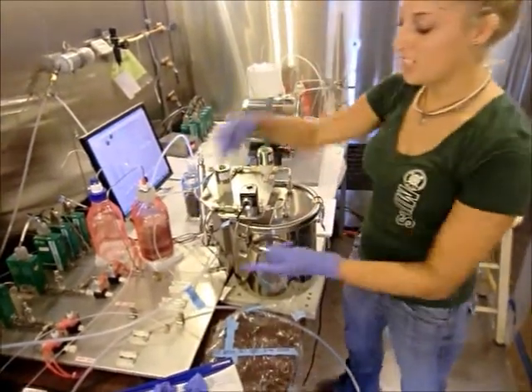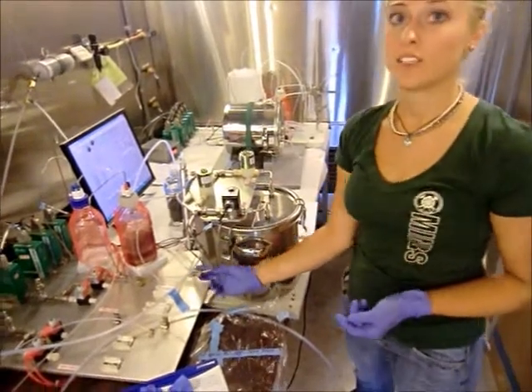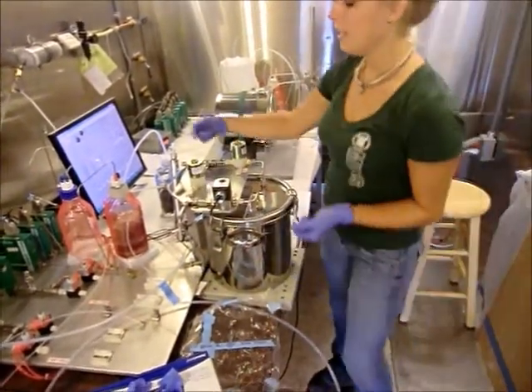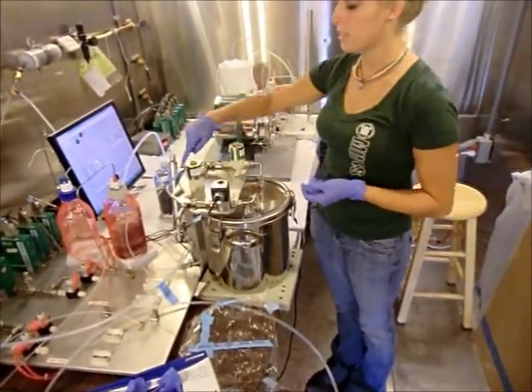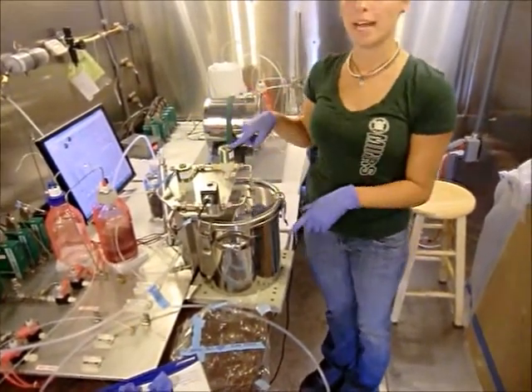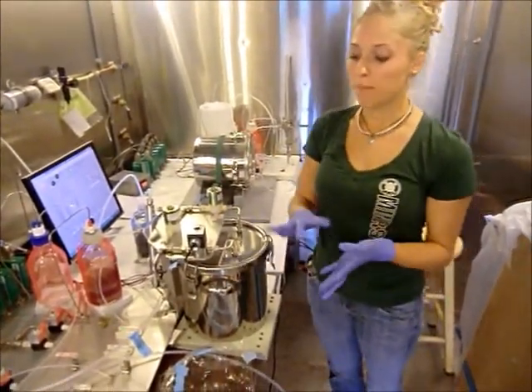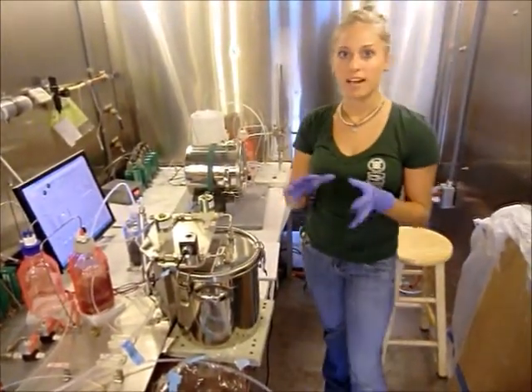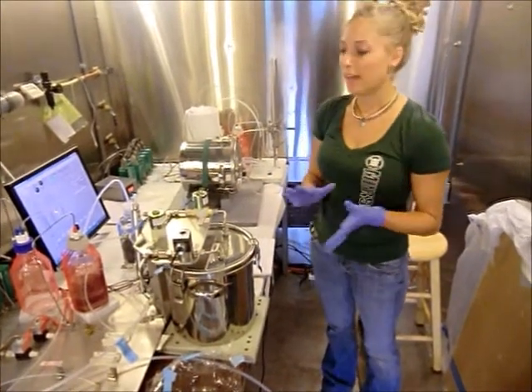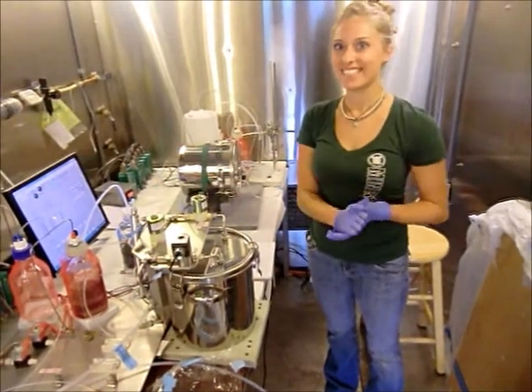And then I would check the bypass, so I would hook the flow meter up here and put a cap down here so that none of the flow's passing. And then I would set the flow so that it's just bypassing the reactor, and then I would check through the reactor. And the flow rate should be about 2.15 liters per minute. And so that's how the system works.